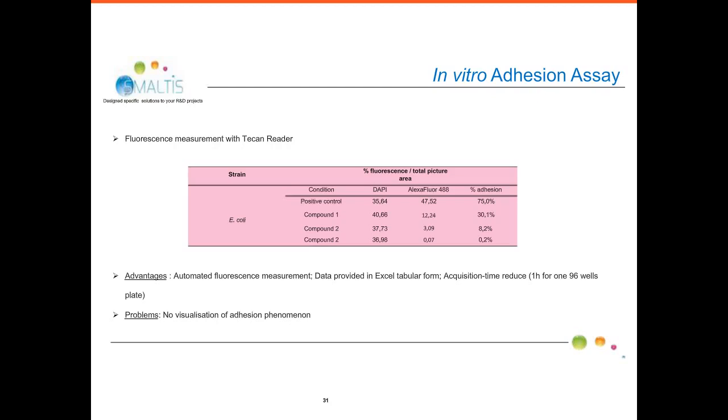With the last compound, we have no adhesion, indicating that the compound has a good effect to prevent bacterial adhesion. So, thanks to the Tecan for this assay, we have won a lot of time. The only problem is that we have no visualization of the adhesion phenomenon as with the microscope measurement.